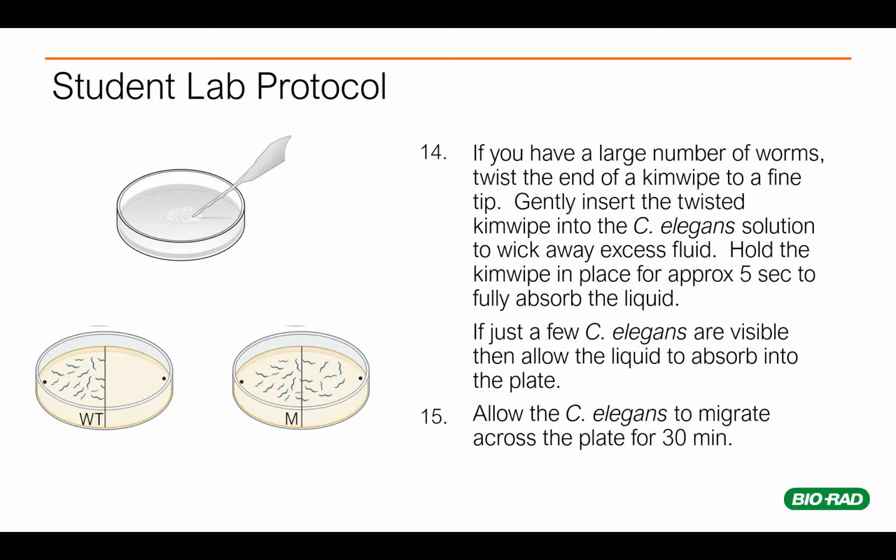Damon, we have a very measured question here. Do we put the plates upside down or right side up? Go ahead and keep them right side up in this case. It'll just make it easier for us to visualize them. Usually the reason you invert plates when we do bacterial plates is because we're going to be growing them and we worry about humidity building up and causing drops to fall down. But we're going to assay these plates at the end of the webinar, and your students will do it in 20 or 30 minutes. So you don't have to worry about humidity building up to the point where it's going to fall back down onto the plate.